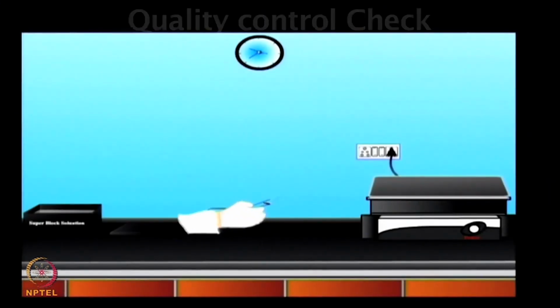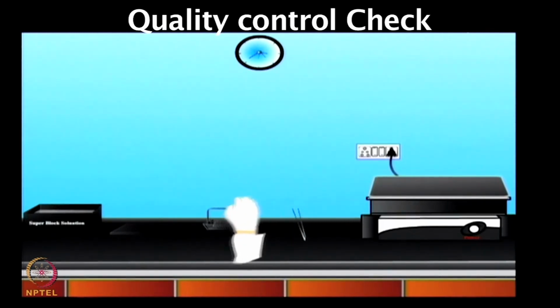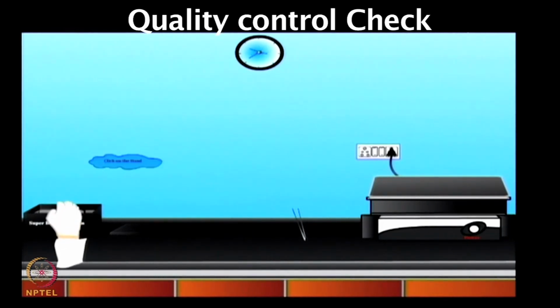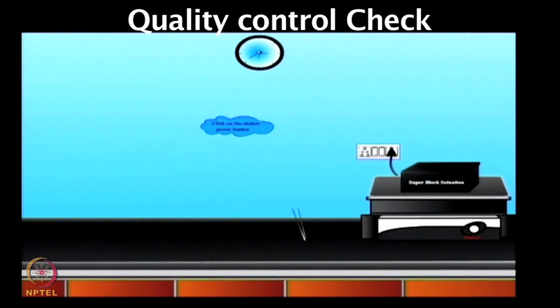Let me show you this animation for quality control checks and how to detect DNA and protein expression on this chip surface. Once the arrays are printed, then we need to perform the quality control checks whether DNA printing was appropriate on these chips. The storage form of NAPPA microarrays is merely DNA. So, in an activated array, all following reactions elapse in the solution and in real time. Therefore, restrictions caused by the instability of proteins occur very rarely.